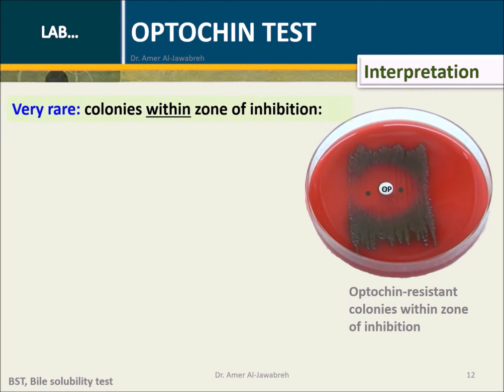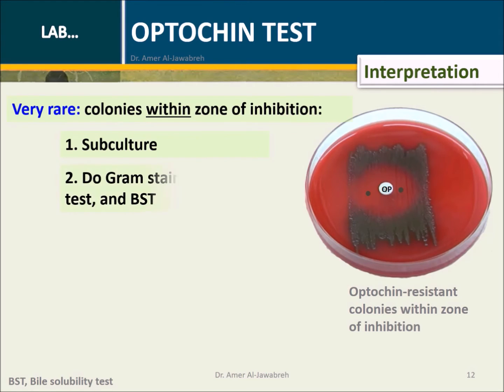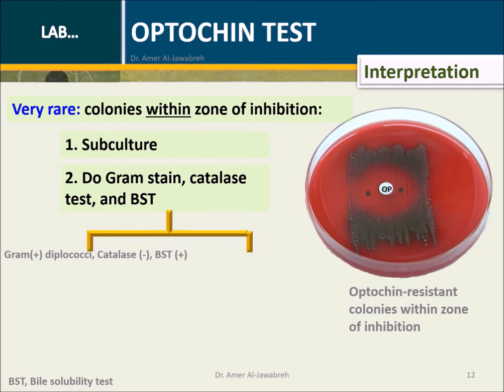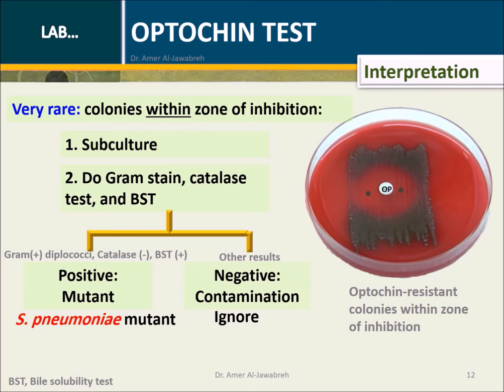Very rare colonies within the zone of inhibition: First, subculture these colonies. Second, perform gram stain, catalase test, and bile solubility test (BST). If the organism is gram-positive diplococci, catalase negative, and BST positive, then it is an S. pneumoniae mutant. Other results indicate contamination — ignore.